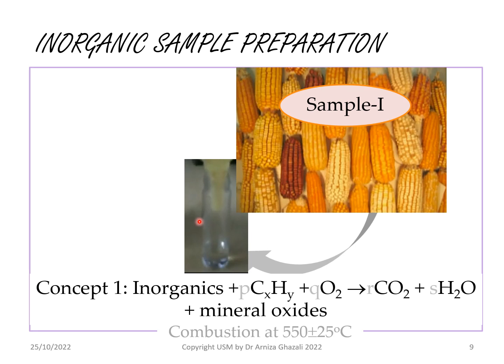It operates basically at lower temperature in comparison to muffle furnace 575. Liquefaction works at 250 Celsius degrees, which is lower. Of course, the organics, instead of converting to carbon dioxide, we get organics dissolving into the acidic solution.